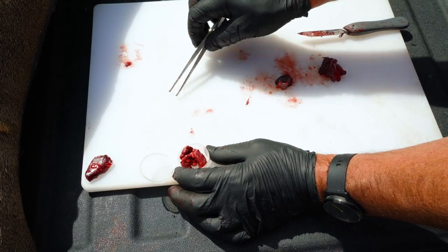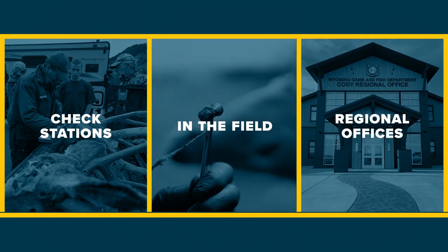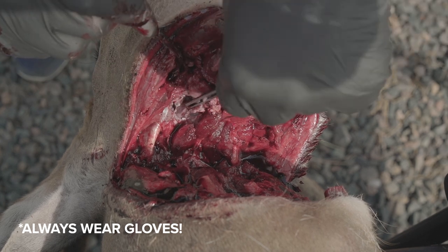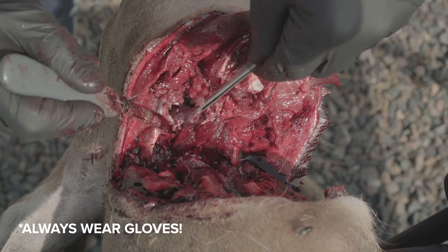The first step is to collect and submit a sample. We collect CWD samples at check stations, in the field, at our regional offices, or receive samples from hunters. The sample is collected from the head — leave about two inches of neck attached to ensure that we can collect the lymph nodes for testing.